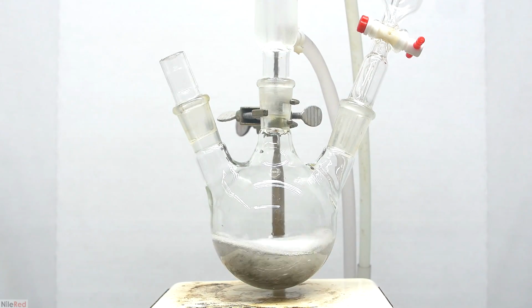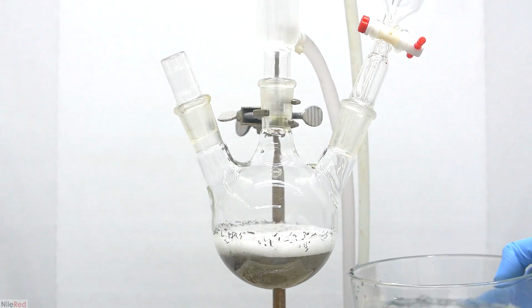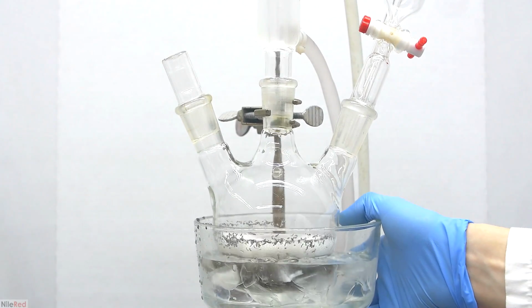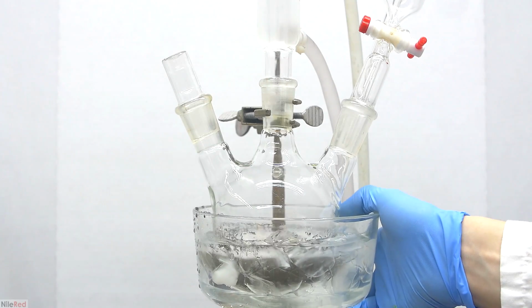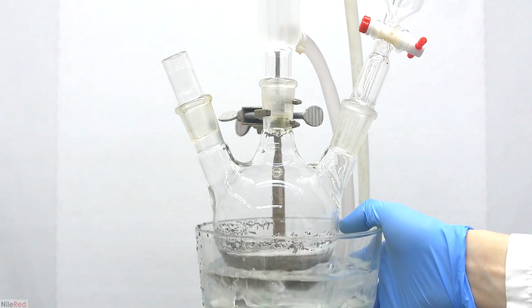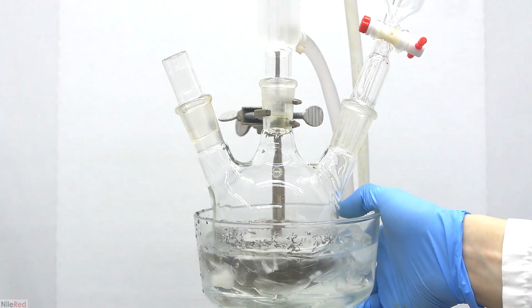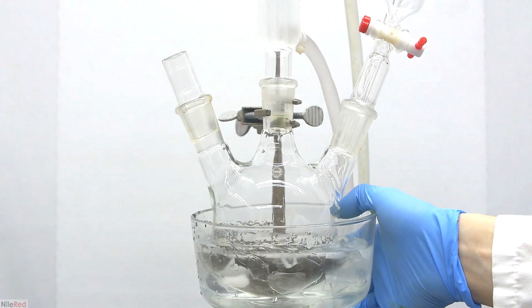It doesn't take long for the reaction to really get going, and at this point, my condenser is getting overloaded. It's not very good when a Grignard reaction boils like this, because ether is just going to be pouring out the top of the condenser. We need to slow things down, and to do this, we use an ice-cold water bath. Our goal is pretty simple, and that's to keep it at a nice steady boil that doesn't overload the condenser.